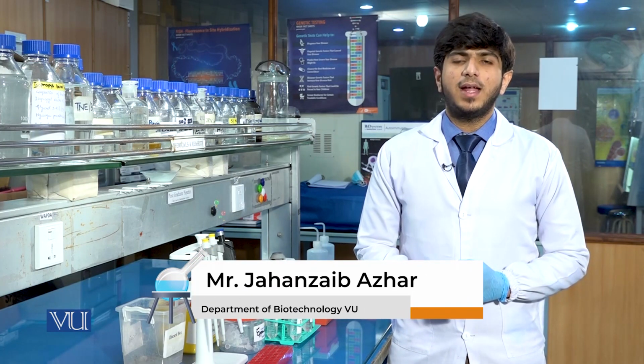Today, we will discuss about DNA extraction. Extraction and purification of DNA is required for various molecular biology techniques. DNA can be extracted through different methods, including organic method, inorganic method, and even through commercially available kits. We will extract the DNA by the organic method.